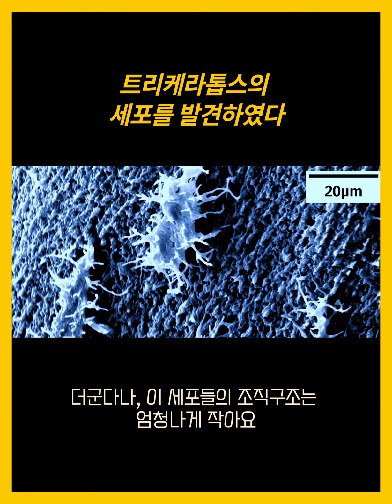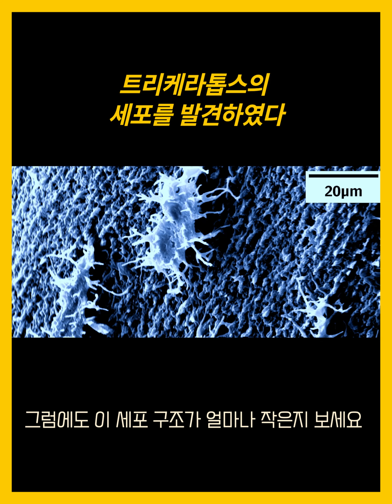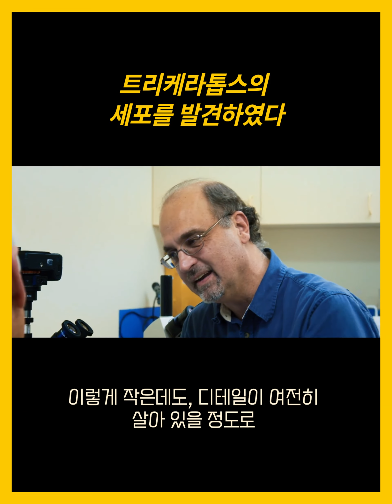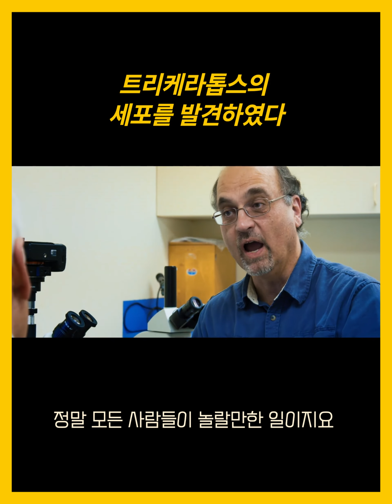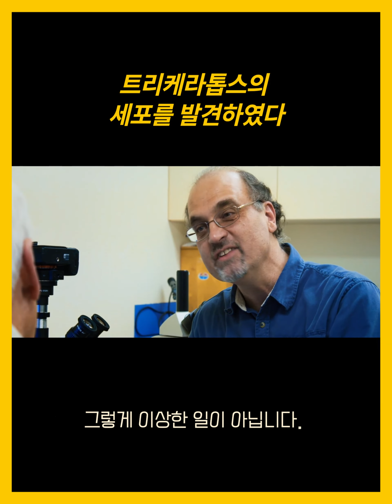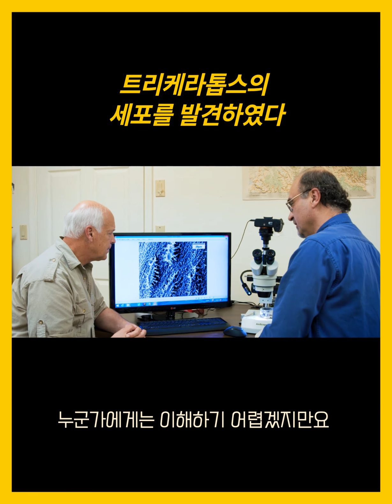I mean, these structures are incredibly small. You know, this is our 20 micron bar here. See how small these structures are, still intact. And yet to see that kind of detail, then obviously the preservation process is surprising really to everybody. But I think as creationists, we have a lot less to explain than someone trying to suggest that this is 65, 70 million years of age.